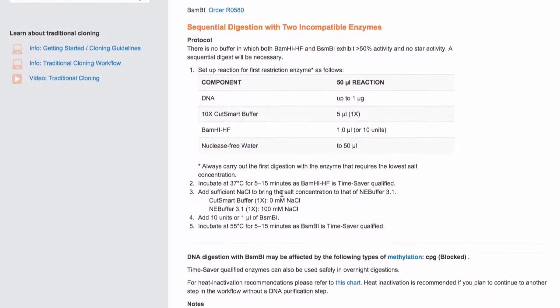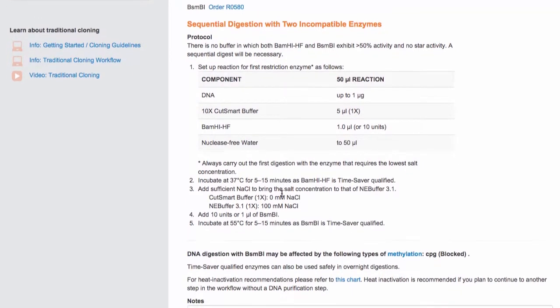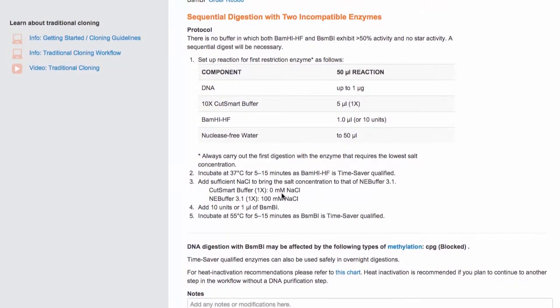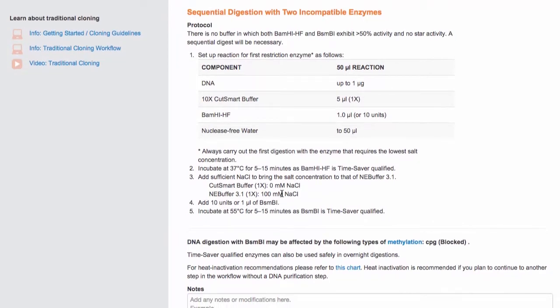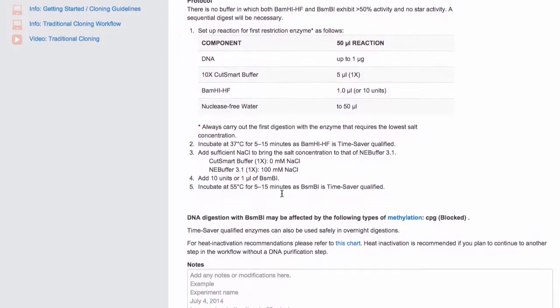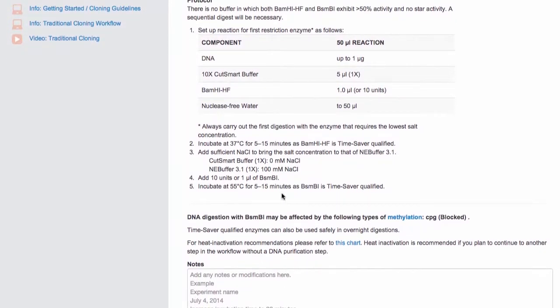the protocol provides you with information on how to adjust the salt concentration so that the second digest can be carried out without a DNA cleanup and buffer exchange step. In certain cases where a salt adjustment is not possible, a DNA cleanup step may be needed.